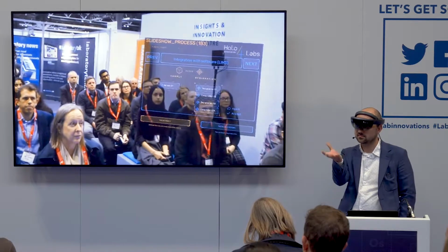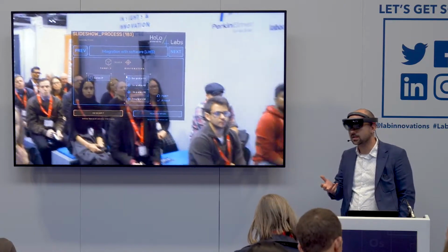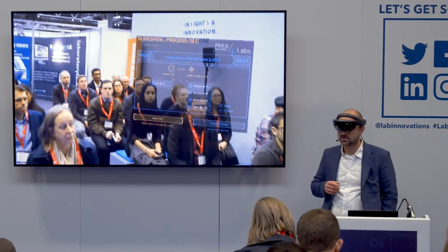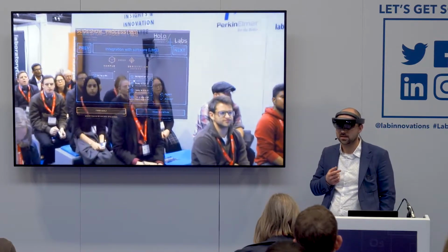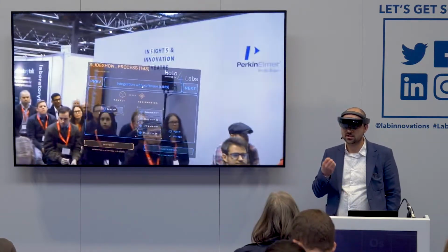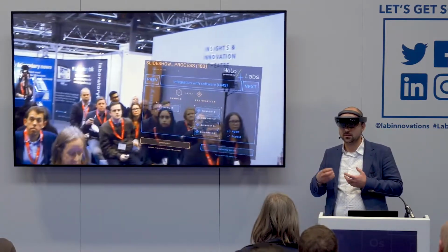So it can also be adapted to all of the systems you have. It is also important that you can manipulate not only with your fingers. I have version one of the HoloLens glasses from Microsoft. Currently there is also a version 2, which is tracking all 10 fingers and also your eyeballs. So you can manipulate with fingers, with eyeballs, and also with voice commands.